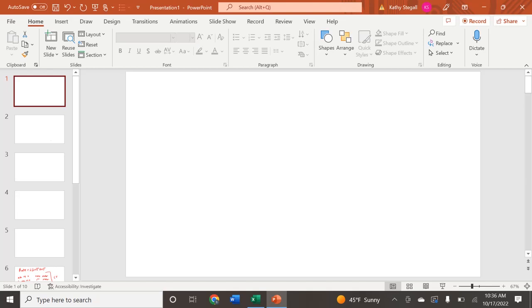So a couple will be colder, one will probably be around room temperature, one will be above room temperature. Or you can do one below room temperature, one at room temperature, and a couple above room temperature. Once you have done that and you have collected your data, you are going to follow the directions in your lab handout to get natural log of absorbance in your LabQuest, and you're going to do that for 1 over absorbance as well, and determine your rate constant K for each one of your experiments.